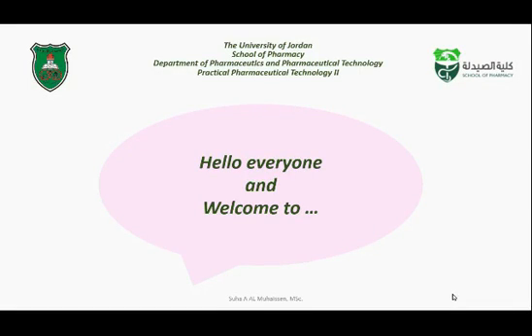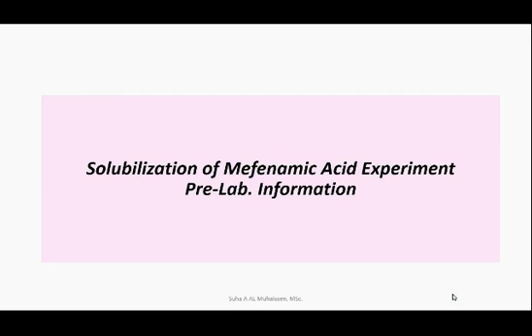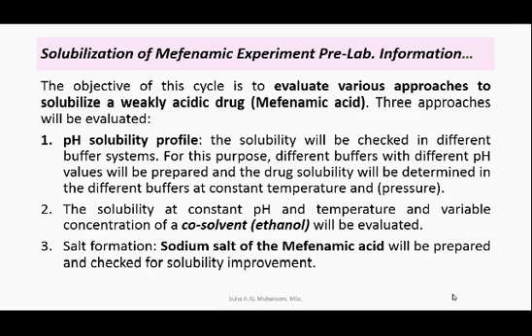Hello everyone and welcome to Cycle 1, Solubilization of Mefenamic Acid Experiment Pre-Lab Information. The objective of this cycle is to evaluate various approaches to solubilize a weakly acidic drug. We will be using mefenamic acid as a model drug. And here we will evaluate three different approaches.